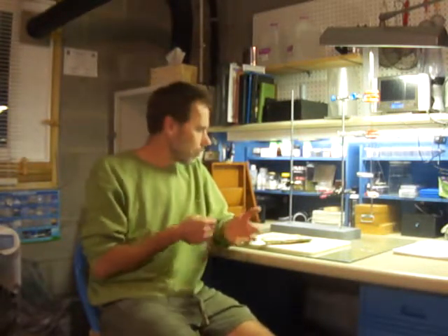And what I'd like to do is not only go over some of the physical properties, some of the obvious ones like the hardness and things like that, which are really very useful, but I'd also like to go a little bit deeper and look at some of the chemical properties too. There are some older methods like borax bead and flame tests and things like that. They're antiquated, but for somebody working in a home lab, it's great when you don't have the expensive instrumentation to analyze some of the stuff.